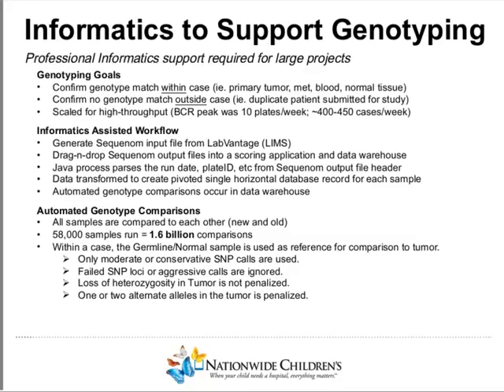Now, maybe just to emphasize the scale that we achieved with this TCGA project: of the 58,000 samples that we have in our genotype database right now, every time we drop another plate into that scoring algorithm, there are 1.6 billion comparisons performed through this approach. So this size of a project really does require a sophisticated tool to be developed for it to run efficiently without error.